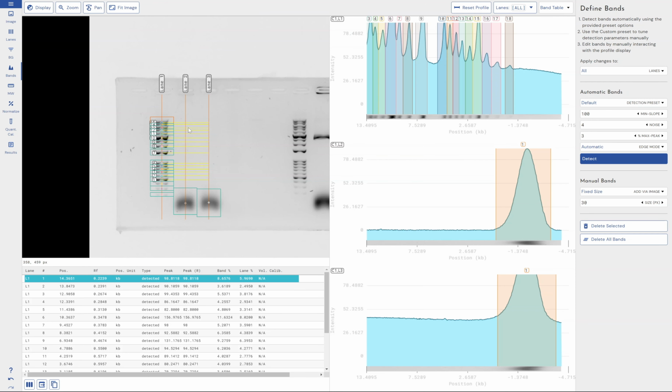So when you've got it on, you can visually check the results that you're getting. So you can see where your bands line up with your molecular weight ladder to validate that you're using the correct extrapolation method, and that basically it looks right to you. So you can go back and double check the calculations that the software is performing to be able to do that molecular weight sizing for your bands.